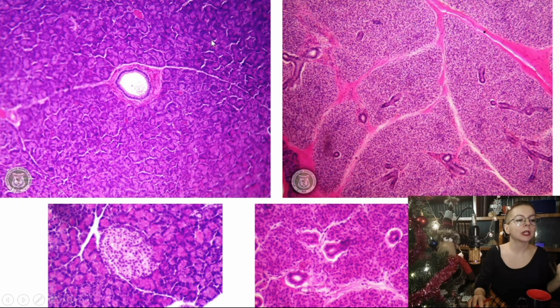Digestive glands, and they both are represented by basophilic secretory cells. They produce proteins. That's why they are similar. But in pancreas, we can't see those striated ducts, which are very prominent in the parotid. So in the parotid gland, inside the lobules, striated ducts are very, very prominent. So if you see them, then for sure this is the parotid, not pancreas.